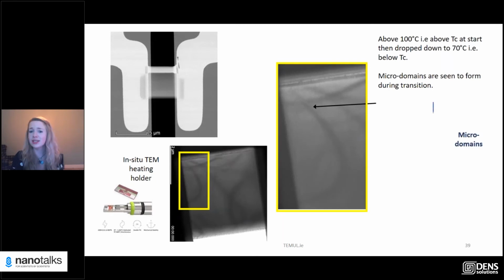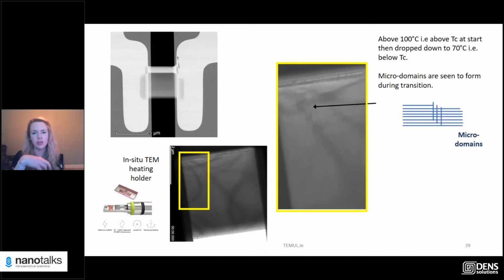Okay, then it's not just biasing. I think the talk at the start of this section showed the change going from a high temperature to the low temperature phase, from the cubic to the orthorhombic or pseudo-cubic. That's very important, because that shearing forms the displacement, and thus the polarization. But what we noticed in the in-situ heating experiments was that, macroscopically, there was actually a pseudo phase or an interphase between those two.